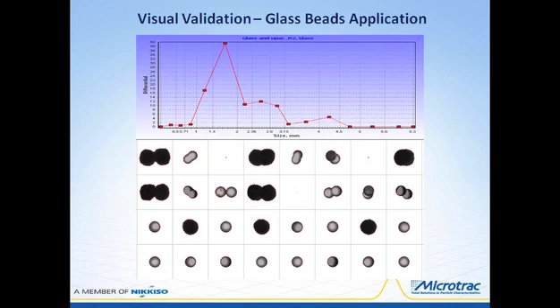This is a sample of reflective glass beads used in highway coatings, with some sand added for traction. In this small excerpt from the SI's image file, we can see good round transparent glass beads, bad fused glass beads, single black opaque particles and agglomerated opaque particles, both of which are sand grains. And the small chips in three spots are probably abraded from the bulk sample, showing in the fine end of the size range. This is a perfect example of how visual validation can answer questions about why the size distribution is shaped the way we see it.